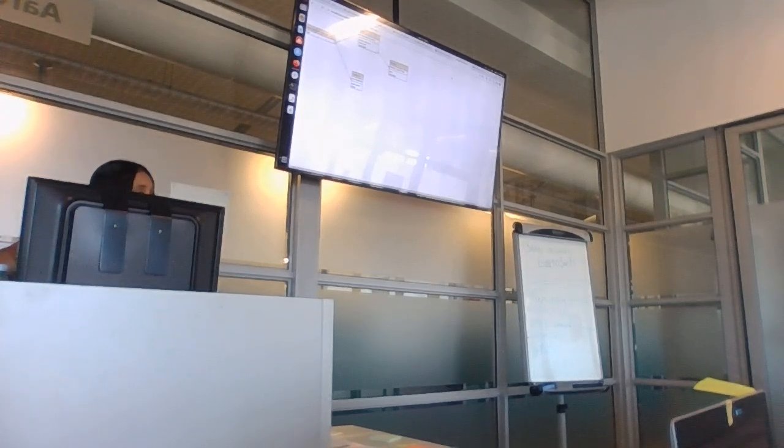If you can extract it while it's running and save the workflow, then you should be able to see it. But if you haven't created the workflow, you won't see this one. So she has to first extract and then go to the workflows to find the workflow that she just extracted. So she can have other workflows running in the background and still be able to extract. Okay, gotcha. So maybe that was the problem.